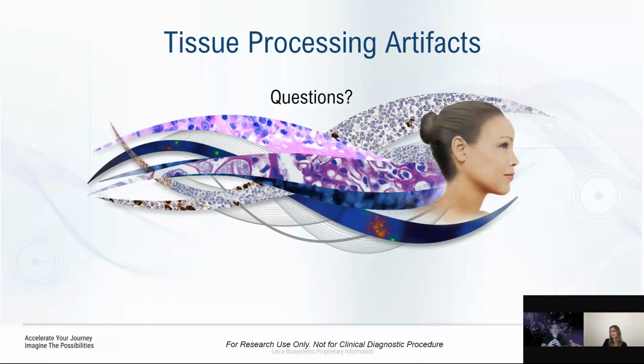So I'm a little concerned that you're getting it fresh, and I hope it's coming in refrigerated, right? That kind of slows everything down. I'm not sure what studies you're looking at doing after you process the samples, but Michel's, even though we call it a fixative, is pretty much a holding solution, and it's a holding solution to preserve immunoglobulins.